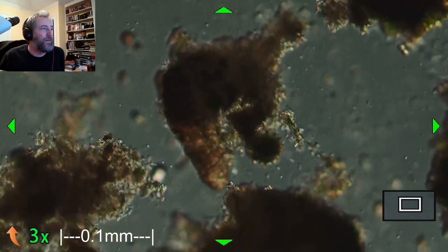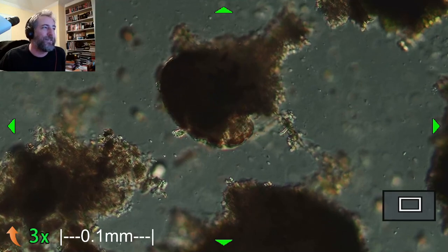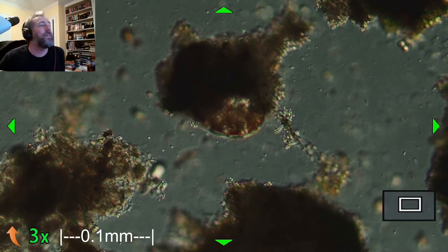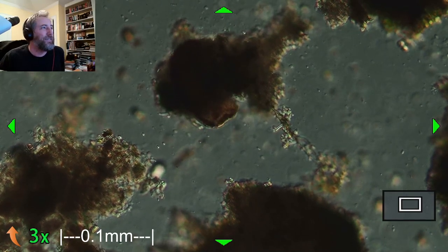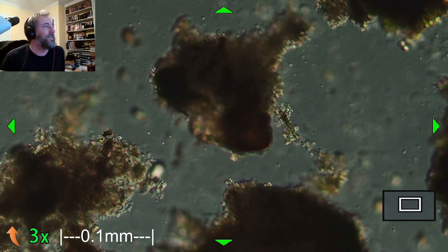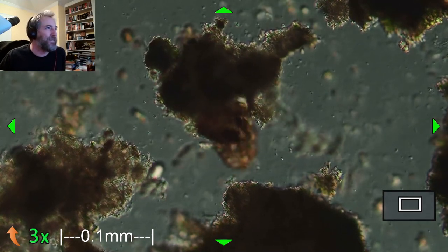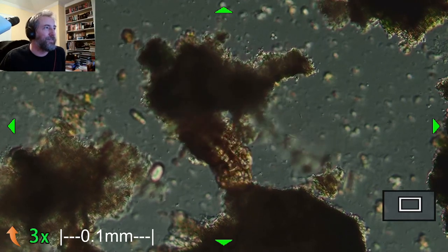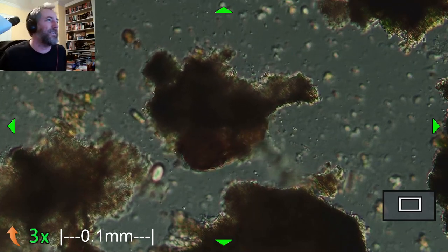Everything that fits in the mouth is food, basically. For a water bear, and for most little, microscopic organisms, if they have a mouth, the gape size, or the size of the mouth, determines what they could eat. Especially if they don't have eyes, right? They just shove things in there. Although they may be able to use chemical sensors to detect whether it's dirt or actual food.